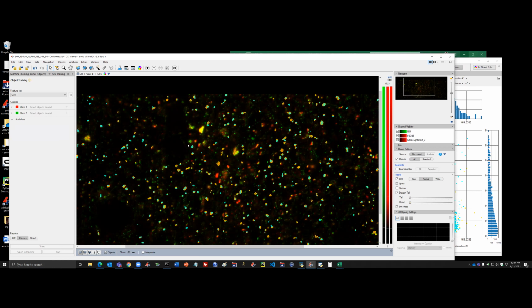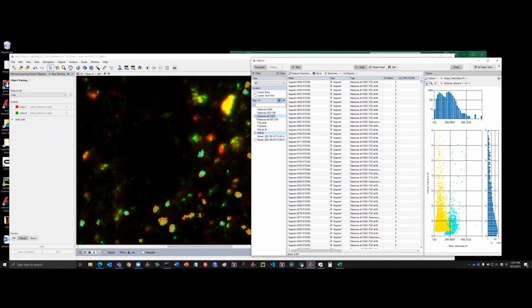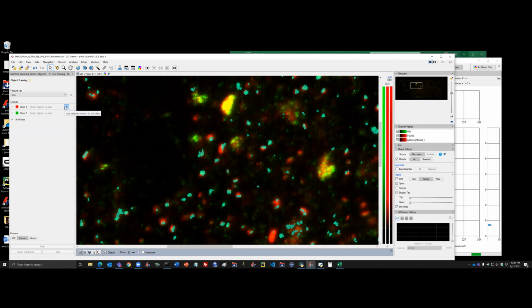This is done pretty easily. What I need to do is select my one type of particles. Let's take, yeah, we have only the filtered ones, and for the whole stack. In this example, I can just say that this is probably too small, and this seems to be the correct one.